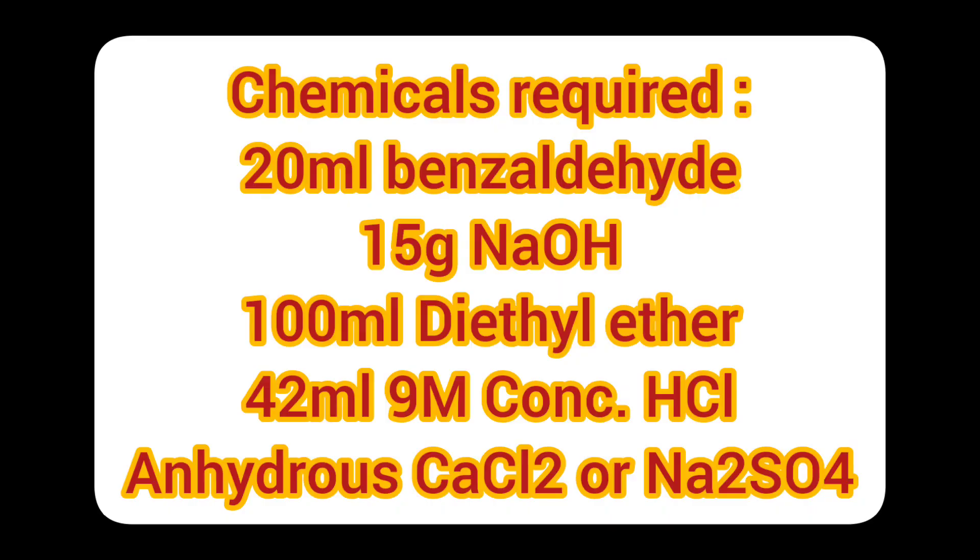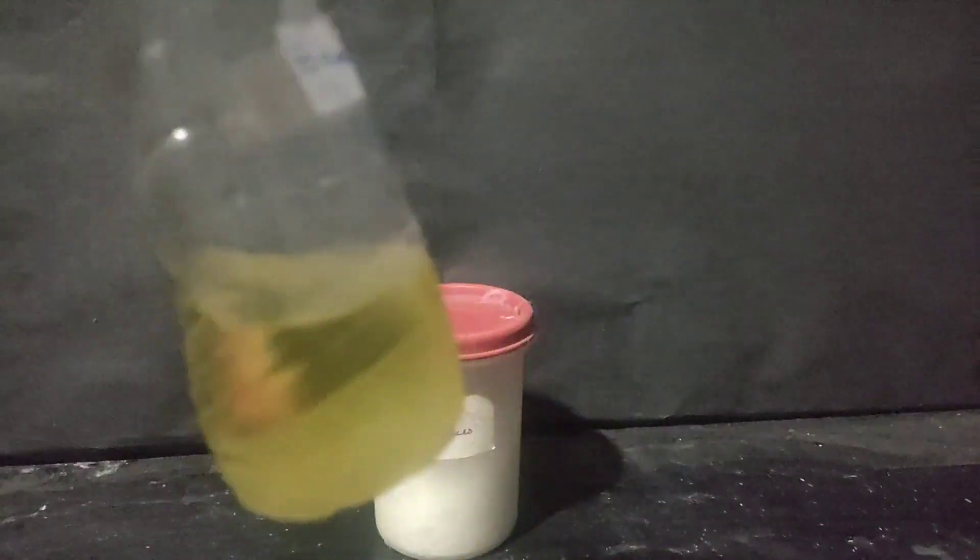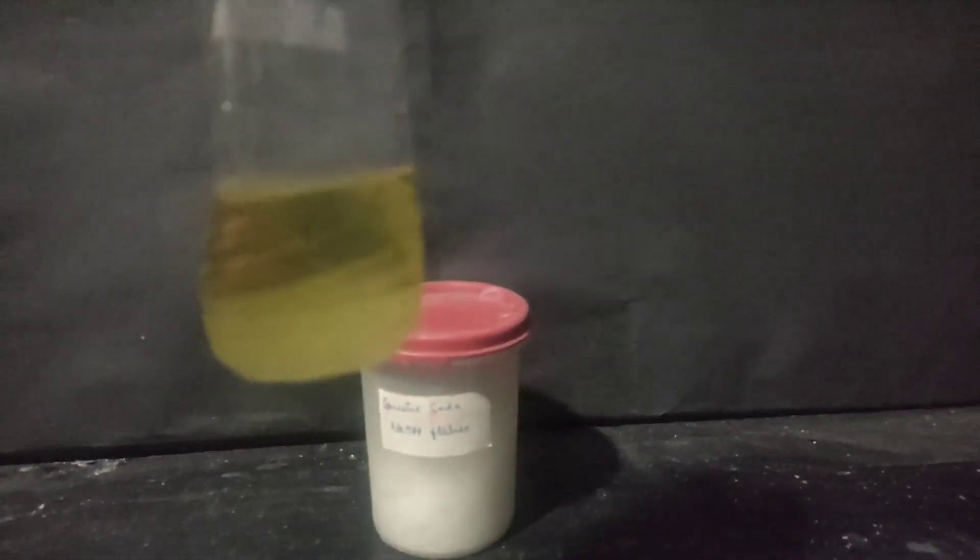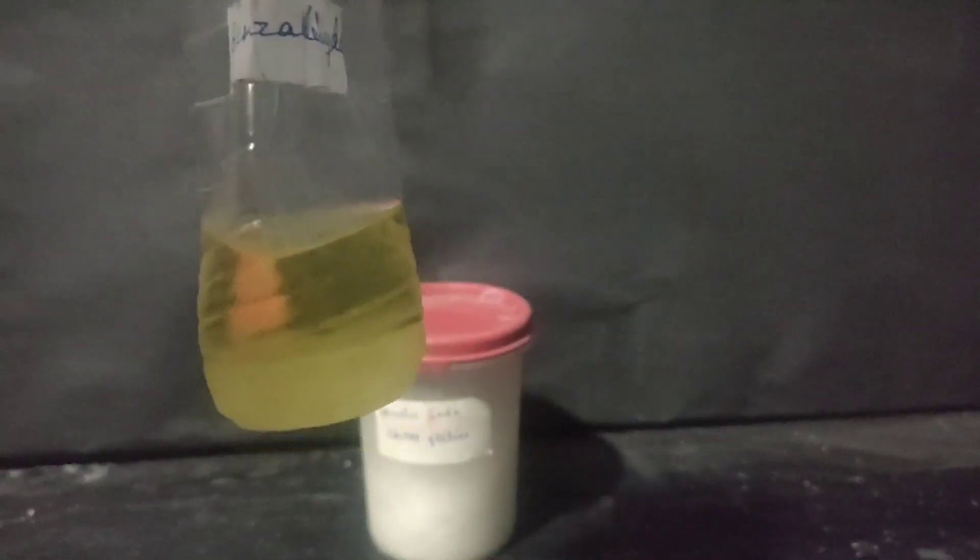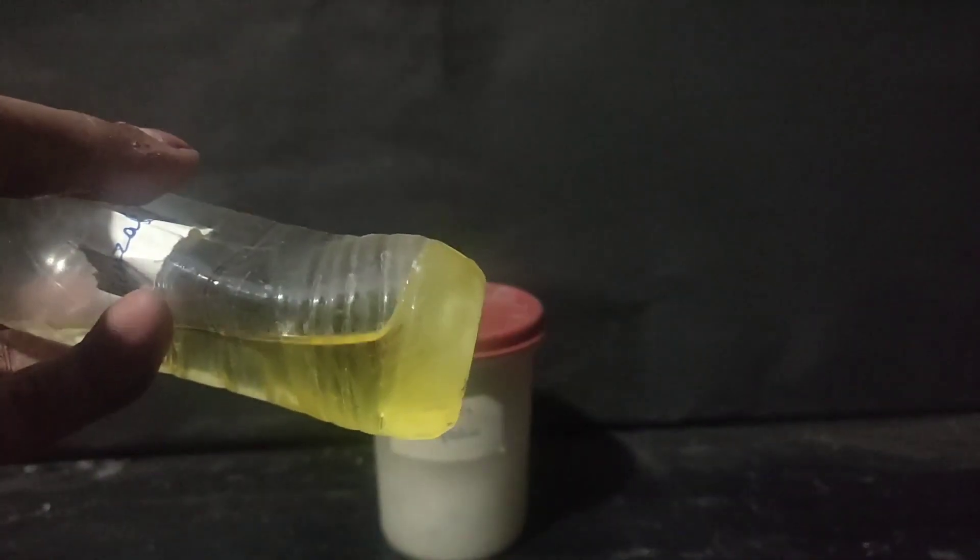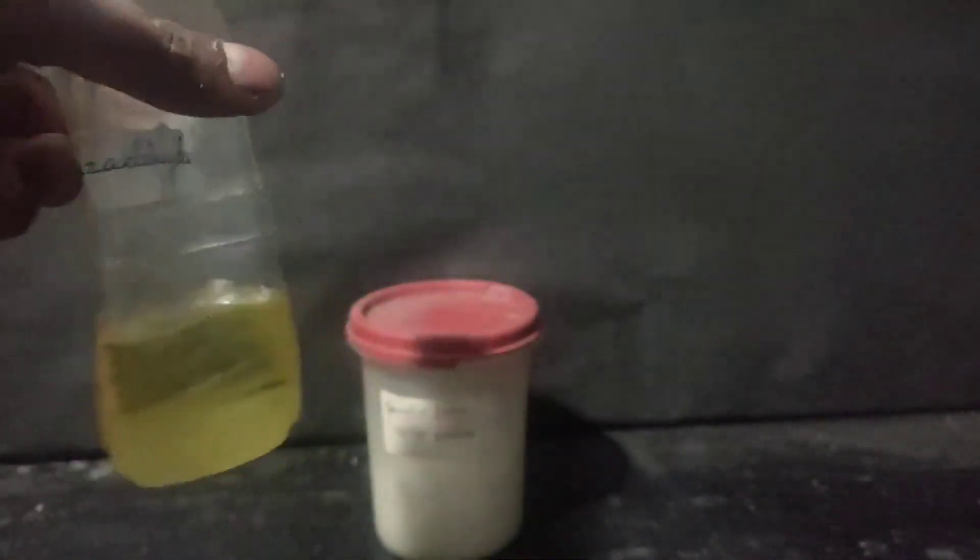So for the demonstration, I took 20 ml of benzaldehyde, 15 g of sodium hydroxide, 100 ml of diethyl ether, and 42 ml of 9 molar hydrochloric acid which will be used later for the workup. But as you can see, my benzaldehyde is yellow colored and inside the bottle some white crystals of benzoic acid have been formed.